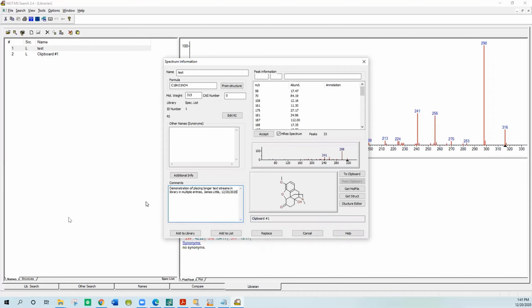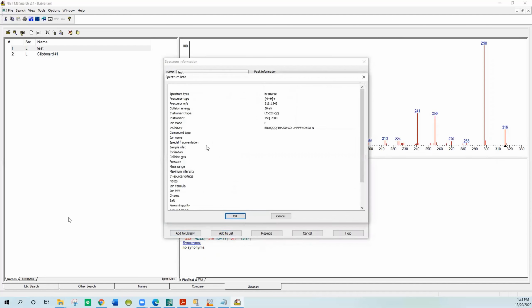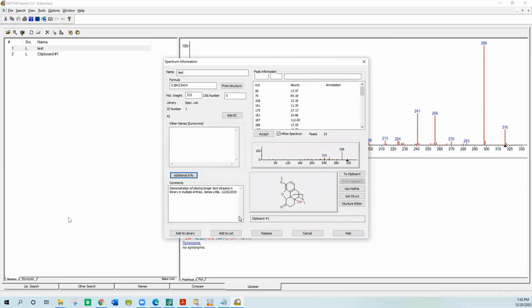You can also put in these other additional information fields here if you want to, if you're going to do the same one in every one. If you read the detailed text, it tells you how to paste those in too, so you don't have to type each one if you type in the proper designator every time. But I won't show you that, but it's in the text if you want to do it.